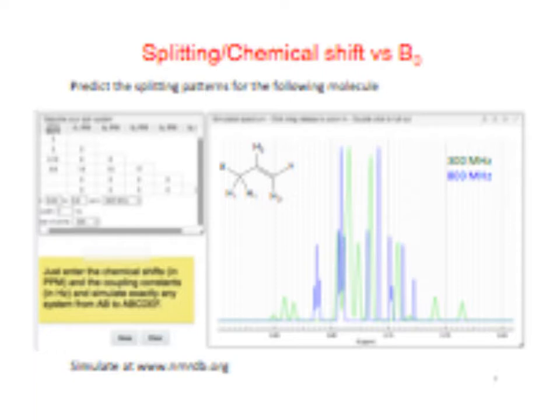Why is it not equivalent? Why is it not equivalent in intensity, the two triplets? You mean these two or these two? Those two, right. That's what I showed last time, the regular second order effects, is that they start to point towards each other.